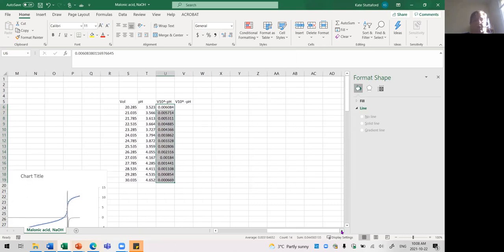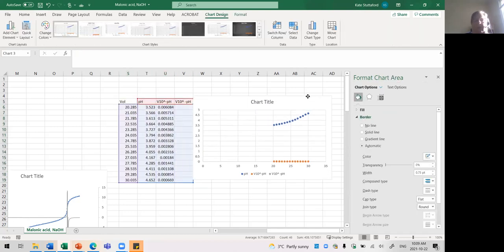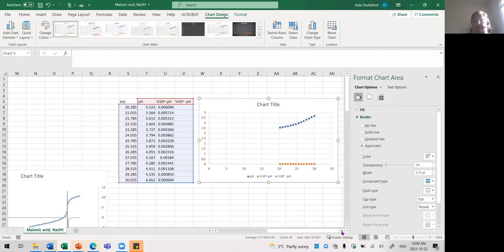All right, so our graph is this value versus this value. So I'm going to highlight the whole thing, and I'm going to highlight this next column. You'll notice I have two columns labeled the same way. And as I said, there's method in my madness. I want an empty column. It's labeled the same, it's going to have the same values in it, but you will see why we want to do this shortly. So I'm going to insert a chart. It's a scatter plot. There we go. There's our chart.